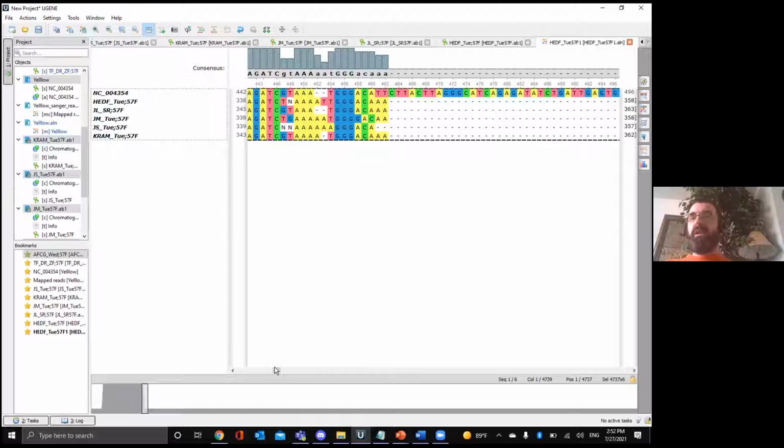Hopefully I can do all this first and then answer the questions. Well, if you have that up and open and then you go and read through the questions, question 14 is all about those consensus bars at the top, right? So you kind of know what those mean. Question 15 is really asking the same question, but in a different way, right? Again, about the consensus bars.